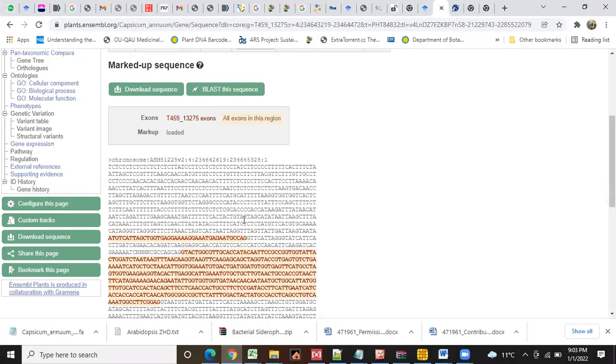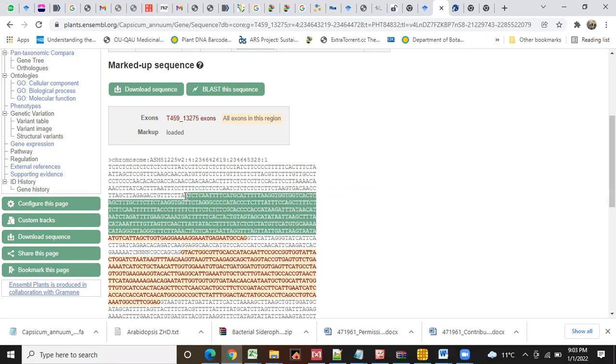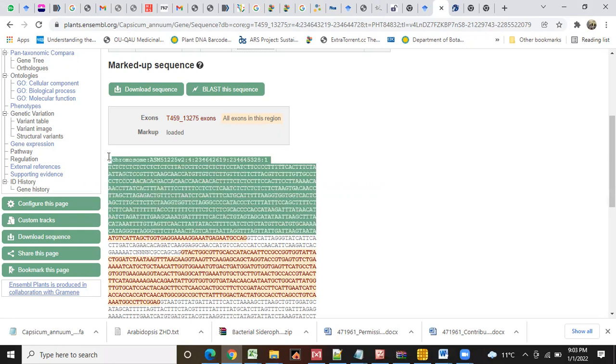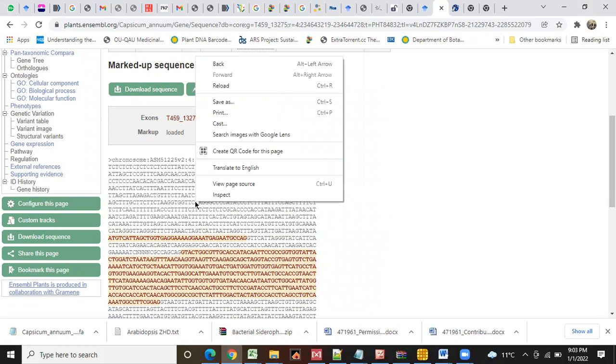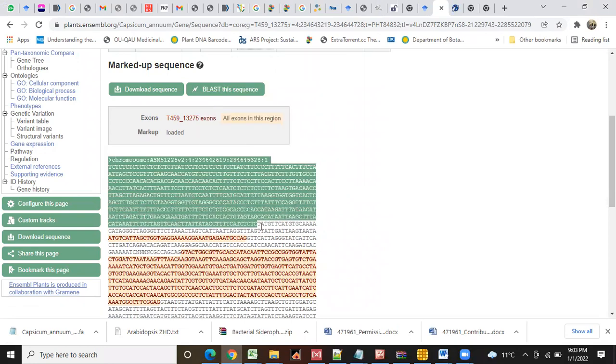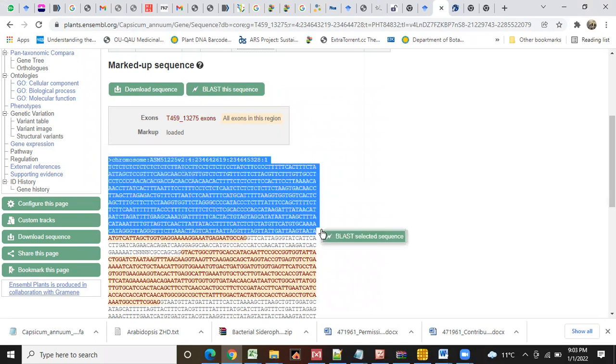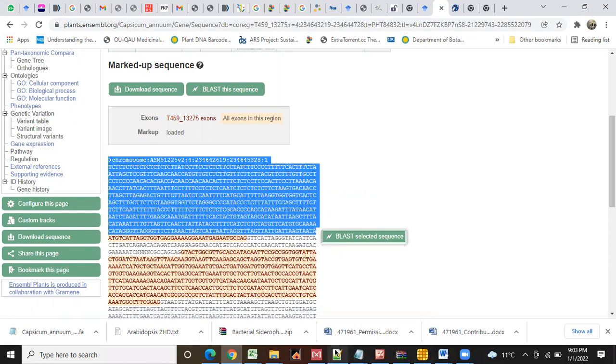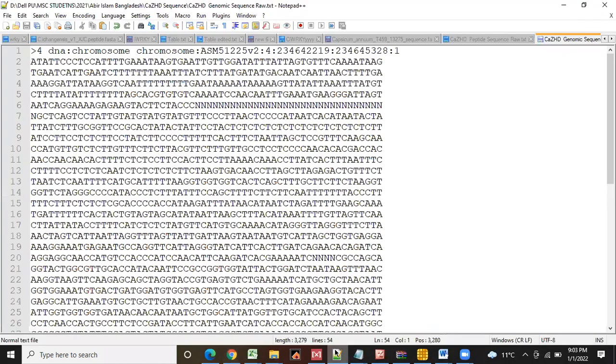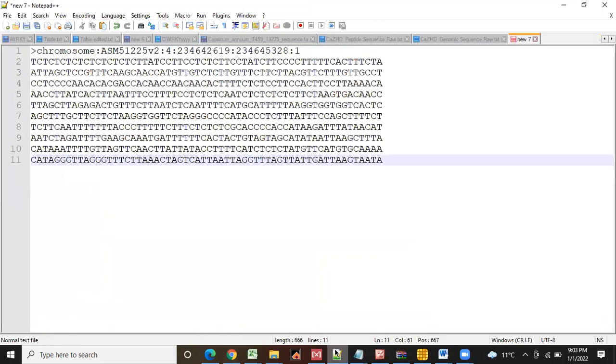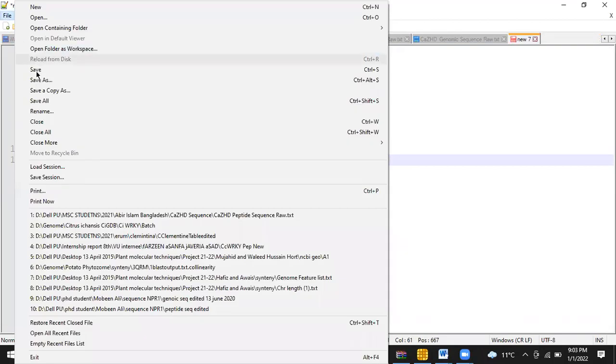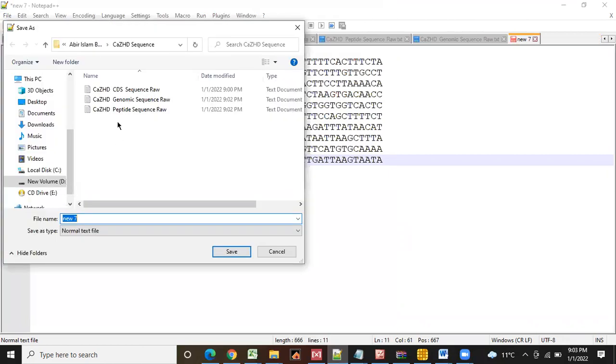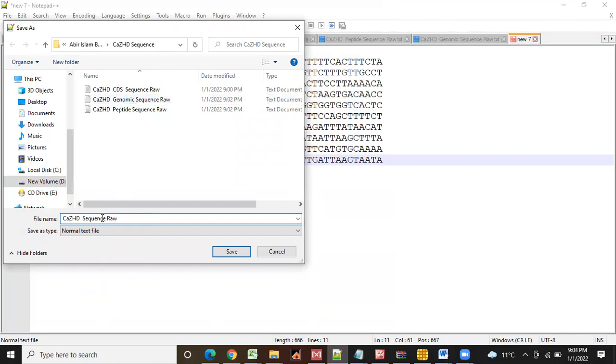And similarly, you have to do one thing more. There is a, whenever you - there is an ATG. And you will also need to copy the promoter sequence. You will copy the promoter sequence from here for this regulatory element analysis. Just copy that sequence from the start codon up to that and then make another folder which you will call promoter sequence. That contains only promoter sequence. You understand what I mean?